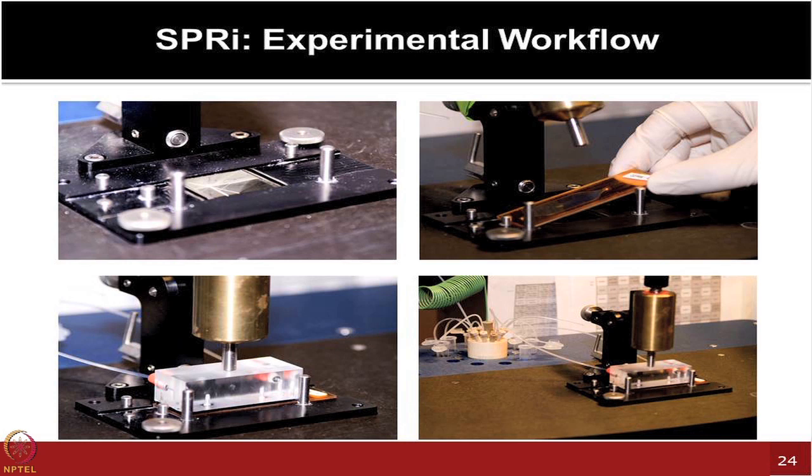And it probably reminds Josh of one of the old setups we have, the prototypes, where you can test 8 antibodies, for example, or 8 different proteins in a very new format, like you are developing a new instrument setup, and these kinds of solutions are coming in. You have the gold chip, everything is passing over it, and then going back into the washing containers.